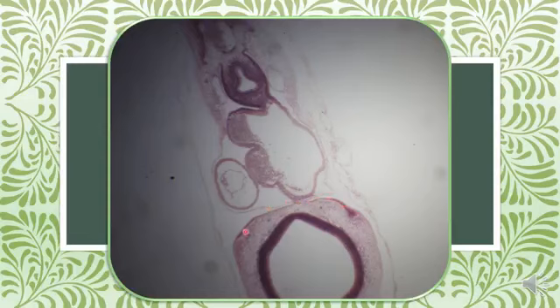A thickening of the ectoderm forming the olfactory placode, later forming the olfactory pit. Neural tube. Esophagus, respiratory diverticulum. The cavity between the gut tube and the respiratory diverticulum is called the pleural cavity.